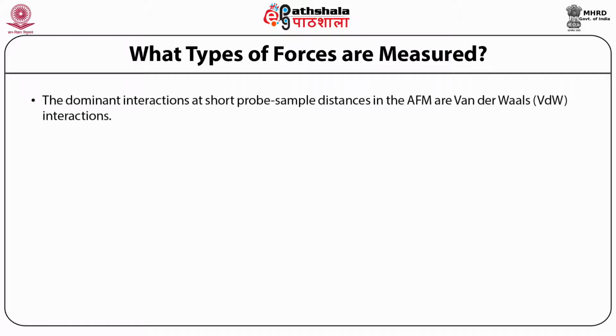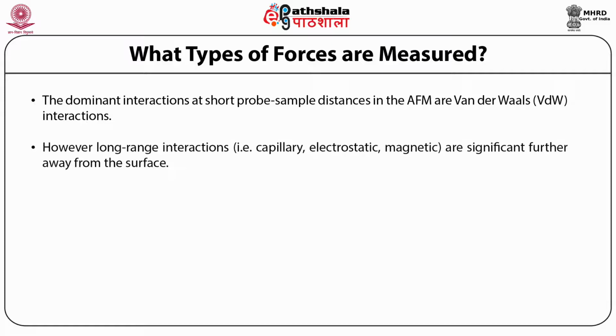The dominant interaction at short probe-sample distance in the AFM is van der Waals interaction. However, long-range interactions such as capillary, electrostatic, and magnetic forces are significant further away from the surface. These are important in other SPM methods of analysis.